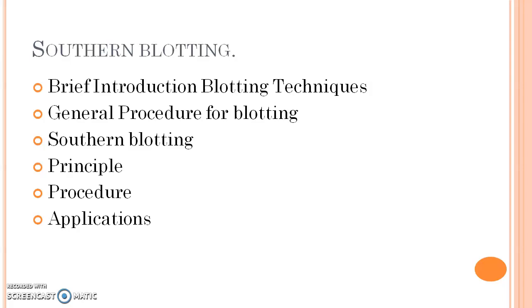Dear students, we will study Southern blotting under different headings like introduction to Southern blotting, general procedure for blotting, what Southern blotting is, its principle, its procedure and applications involved in it. Just in order to make the content brief, in this video we will go through the introductory points related to the blotting techniques.